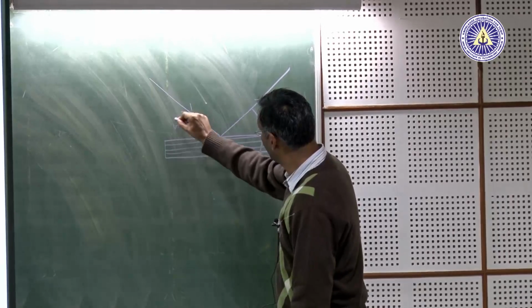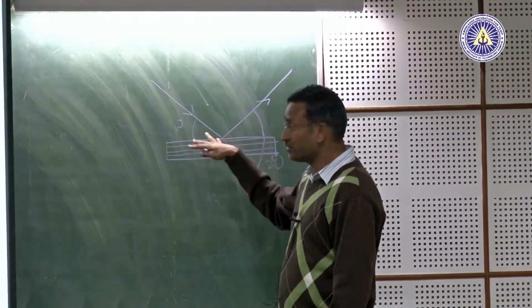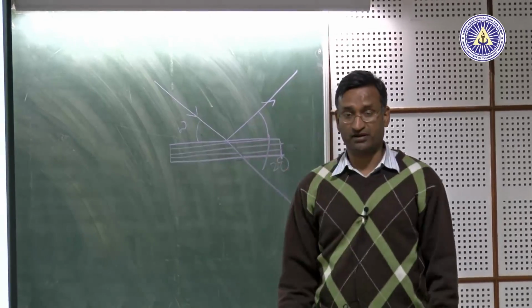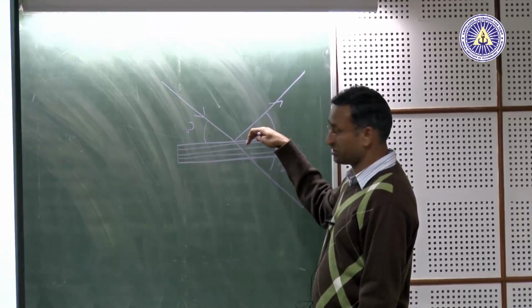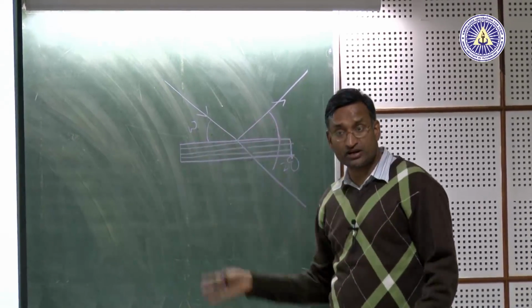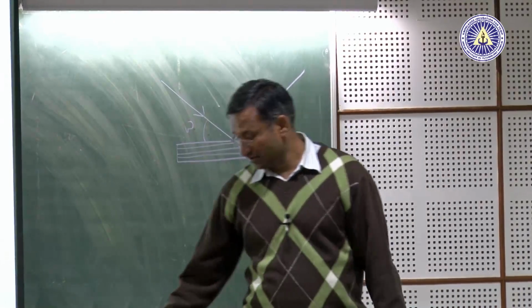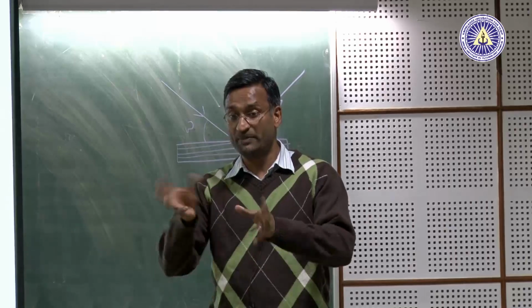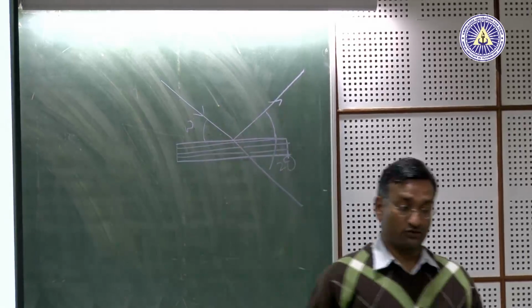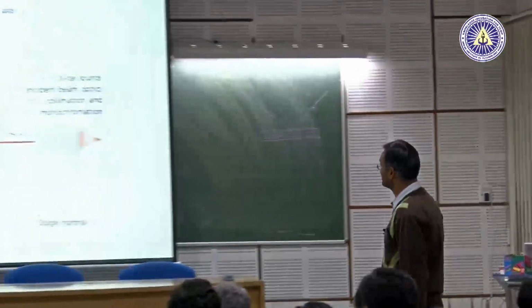and this is omega. Typically in most diffractometers, because of sample alignment problem, omega and 2 theta are decoupled. For a Bragg condition to be satisfied, omega is equal to theta, but omega is not equal to theta in most conditions because alignment is not perfect. So, in diffractometer language, you do not call it theta, you call it omega, because you can independently move it to align the sample.